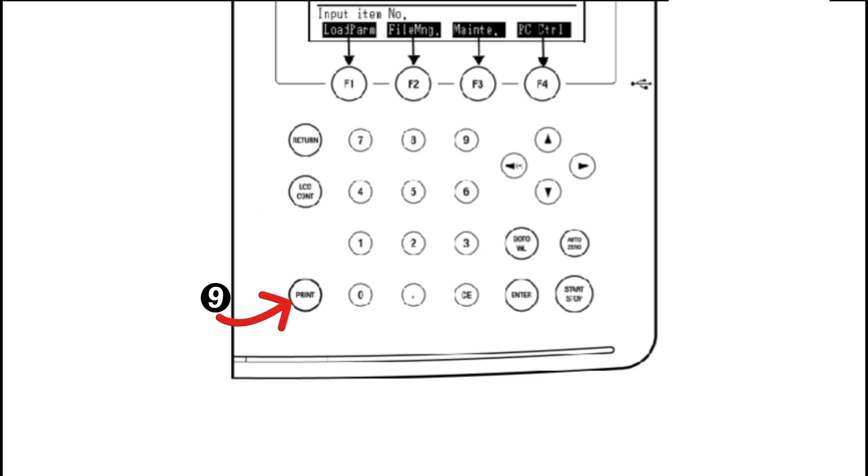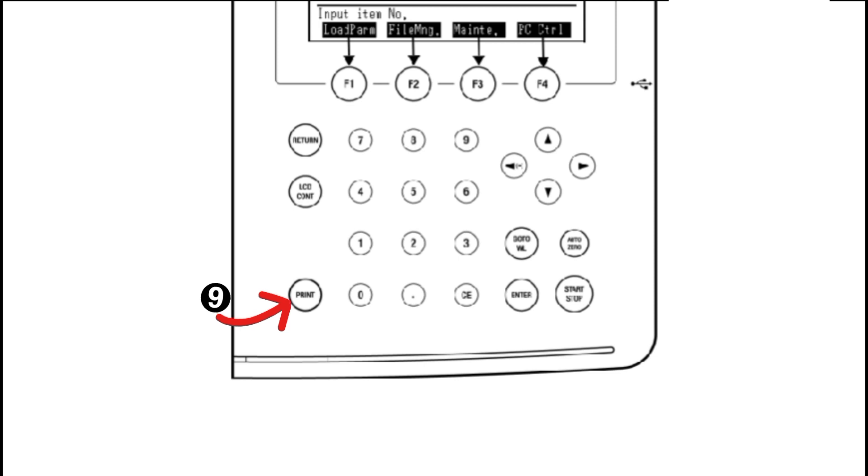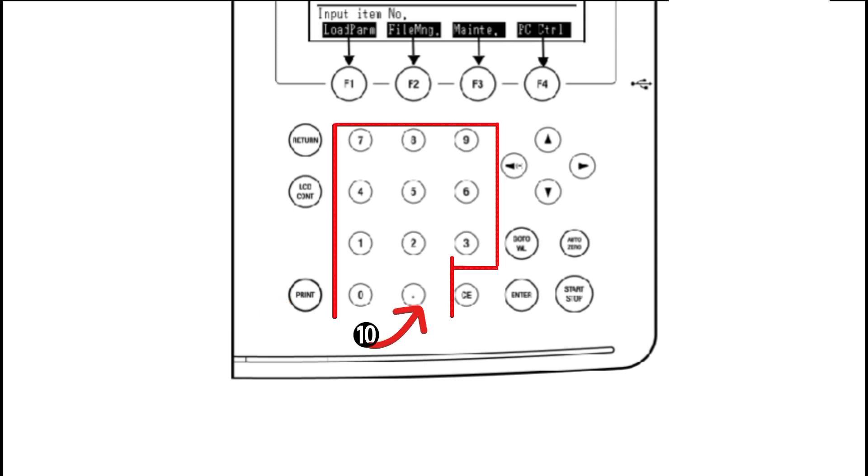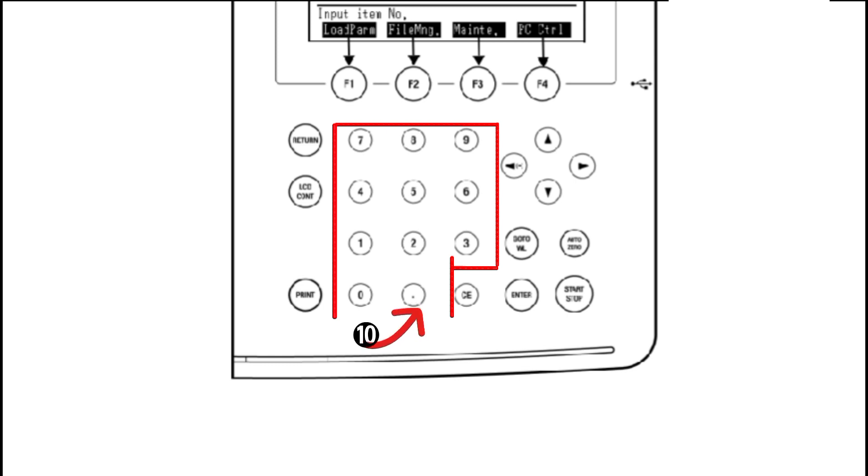Number nine is the print key. When we press the print key, through this key we can get a hard copy of the LCD screen. Number ten is the decimal or zero to nine numeric value key. These keys are simply used to enter numeric values which may be in decimal or from zero to nine value.